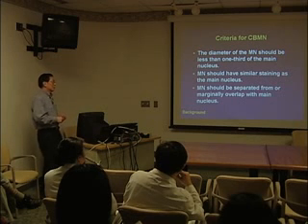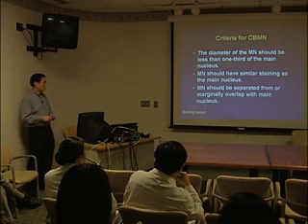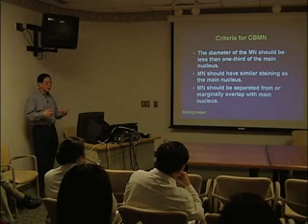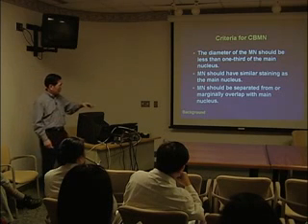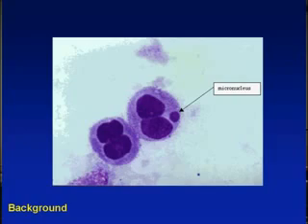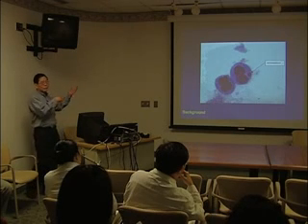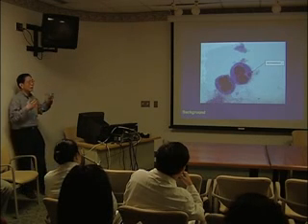And finally, the micronuclei should be separate or very marginal overlap with the main nucleus. And that's, again, if you have a multinuclei but not micronuclei, this is a way to separate them. And sometimes there's additional criteria, but it's not applicable to every type of cells and conditions. That is the relationship of the 2 nuclei. And sometimes it's defined as that you have to have some kind of contact of these two. But if you remember the slide I showed you before, they are separated.